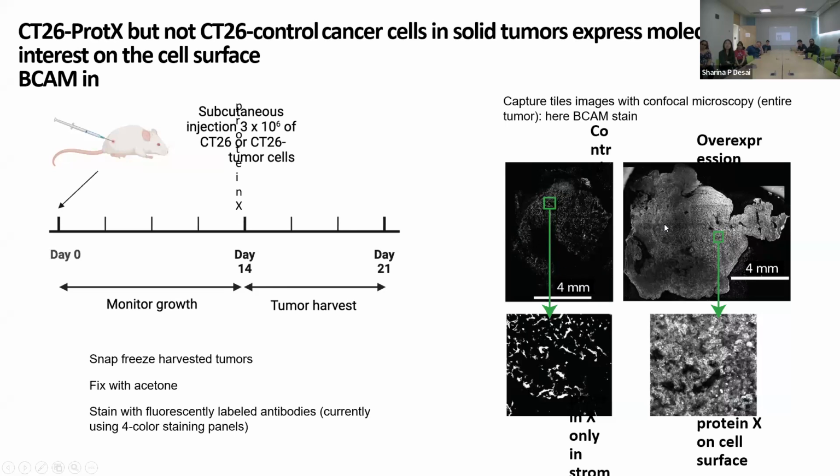And I still find it very exciting because, especially for quantitative analysis, sometimes we talk a lot about how to quantify this and that, but once you start selecting small areas, the whole thing gets kind of tricky. That's a big issue when you select an area. So I think it's really important to look at the whole tumor. It's kind of the standard anyway now, I think, people looking at whole tumors because it's pretty representative.